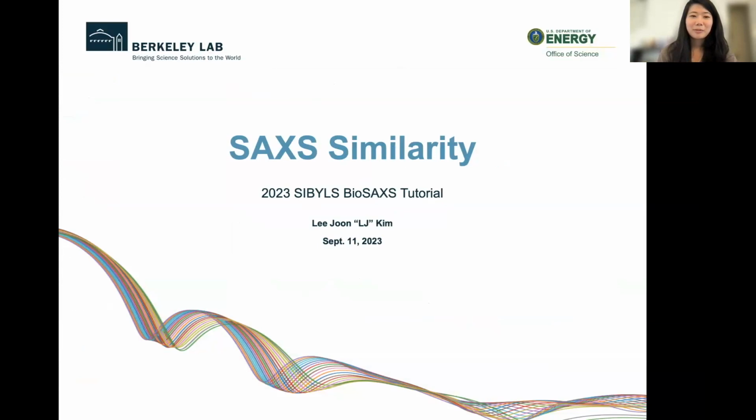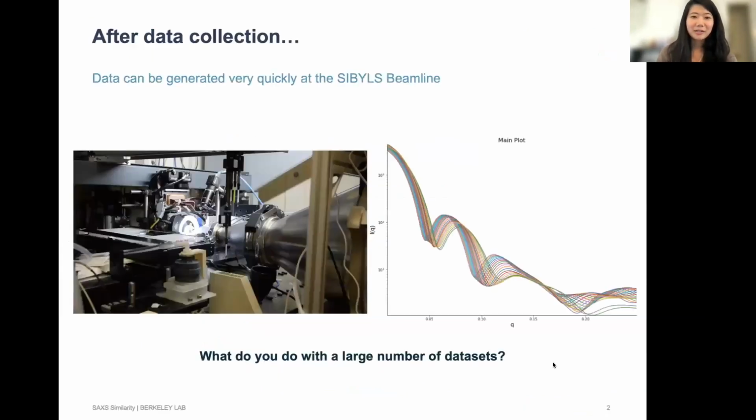I've been primarily working with lipid nanoparticles, really, and using the high throughput SAXS platform to collect a lot of different data sets. I'm not gonna go into too much of the lipid nanoparticle analysis in this talk, but rather I'm introducing a tool that I've been starting to use more and more because of the sheer number of data sets I have to work with. And I'm hoping that this will be as useful for you as it has been useful for me. So let's get right into it.